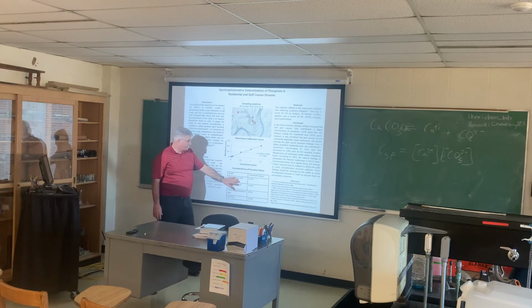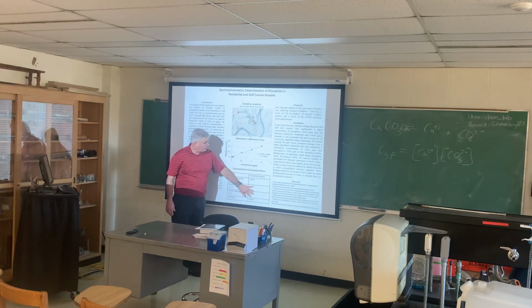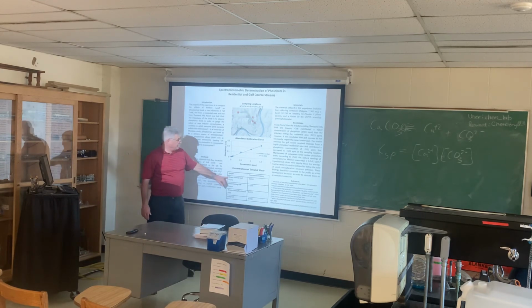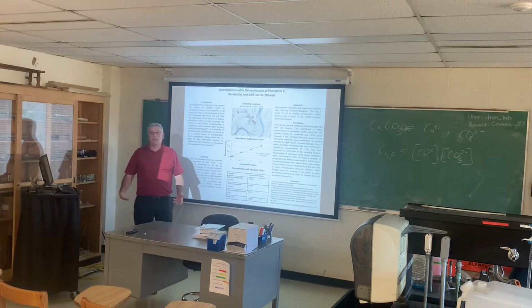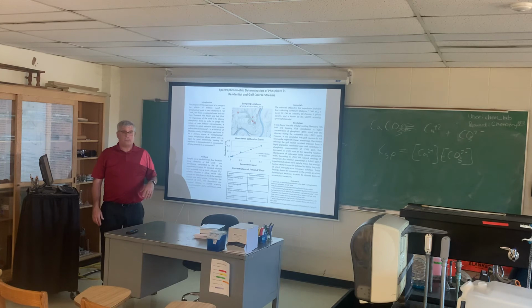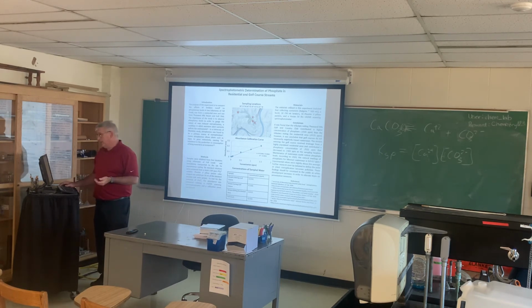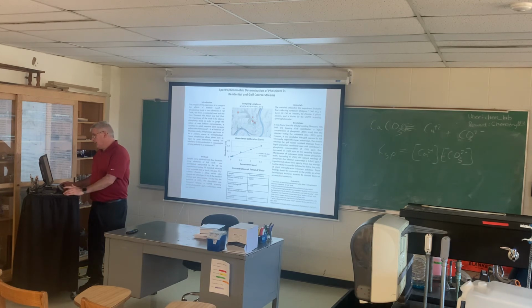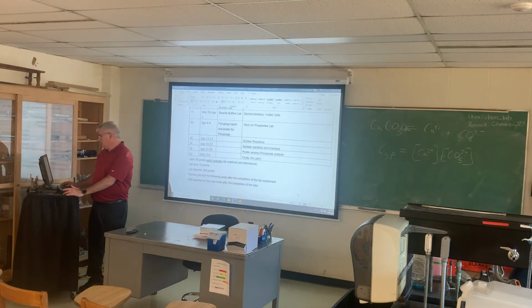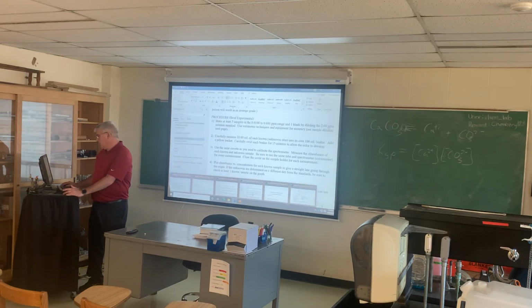And then the concentration, so these are the results in table form to make them easy to see. And what you find is that a golf course has a high influence on the amount of phosphate. If I remember right reading this, there was some rain involved, and so probably some runoff from a residential area that was also influencing that. So anyway, the project. This is how it will culminate. There will also be a report. And just to let you know, I also brought up an example of a proposal.